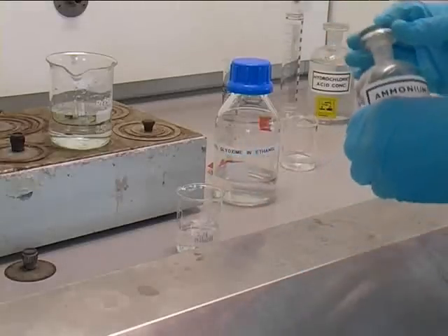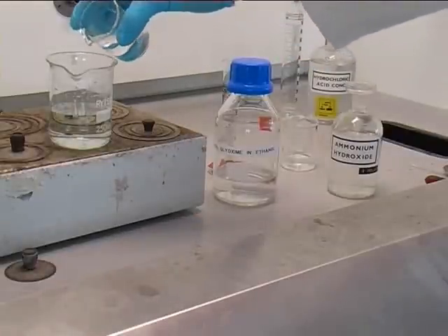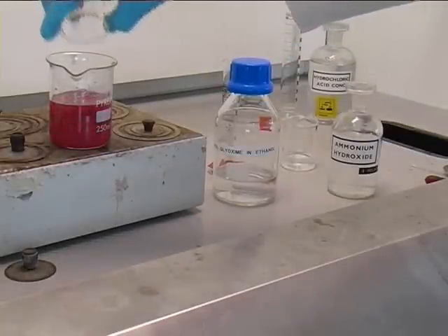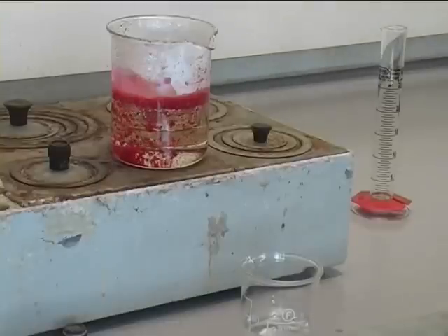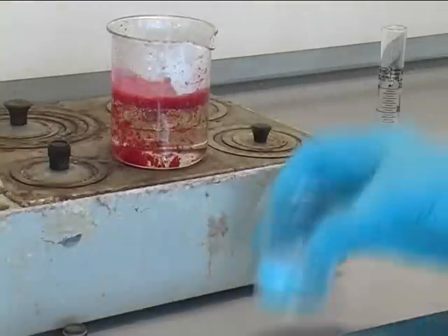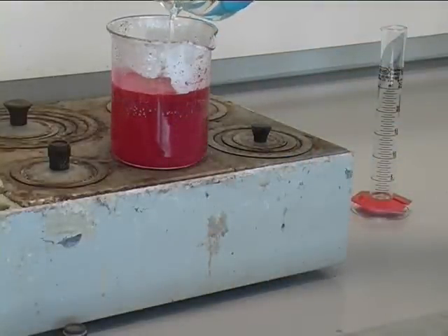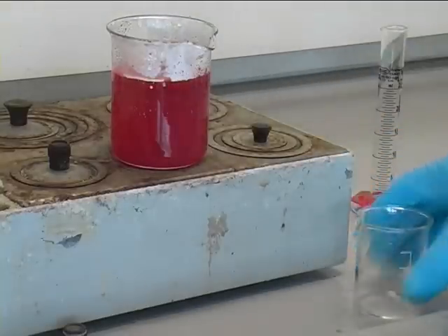Followed by the addition of approximately 30 ml of 2 molar ammonium hydroxide. Leave the red precipitate for about 30 minutes, then add a further 50 ml of ammonium hydroxide. Take off the water bath and allow to cool.